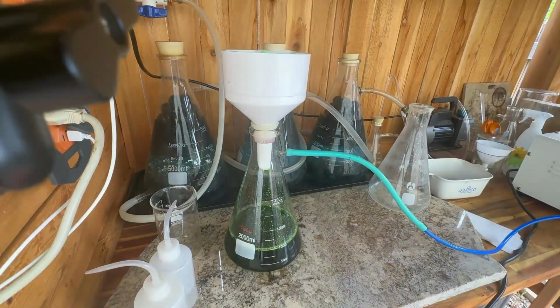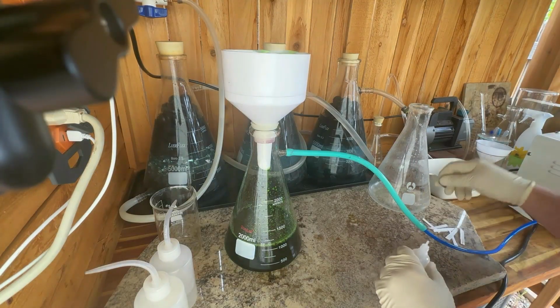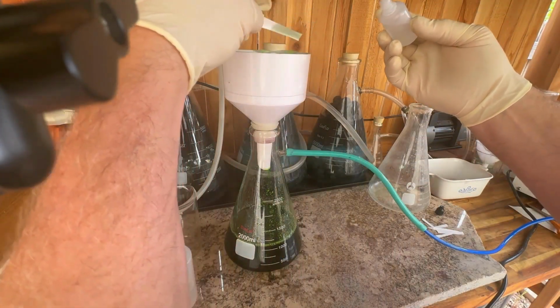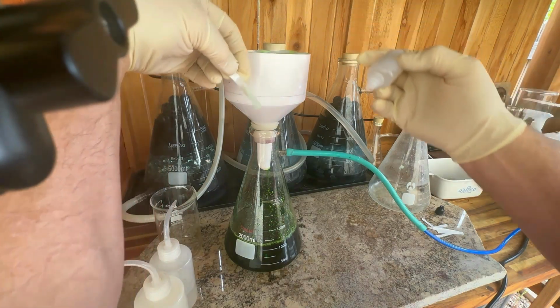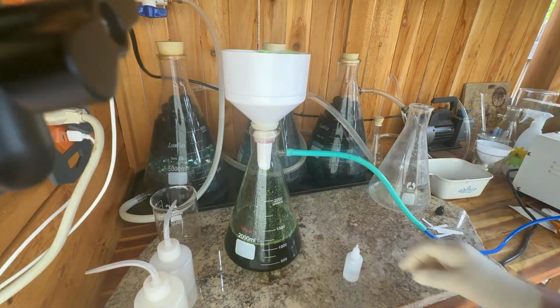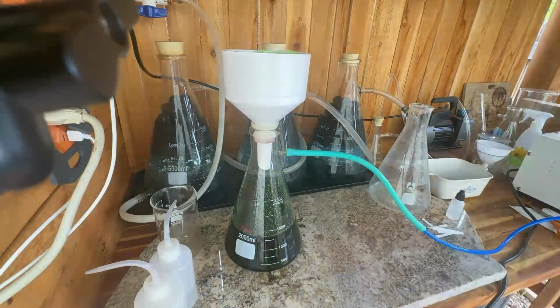I guess before I go too much further here, I should do a quick stannous test to confirm we have gold in solution. You can see here we're getting a decent positive result, a nice dark stain. So there are definitely values in that beaker. The remainder of the solution is evaporated remains of barren waste materials that started to show values as they concentrated.